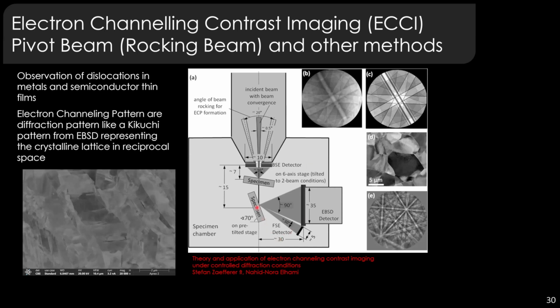But you can also do some imaging of, say, the EBSD sample with the forescatter detectors, and you can get images that will show you the electron channeling contrast imaging. Though in polycrystalline materials, you have to look for particularly dark grains so that you get the contrast to actually see the dislocation structures within them. So you can look at all sorts of different types of dislocations in the microscope.